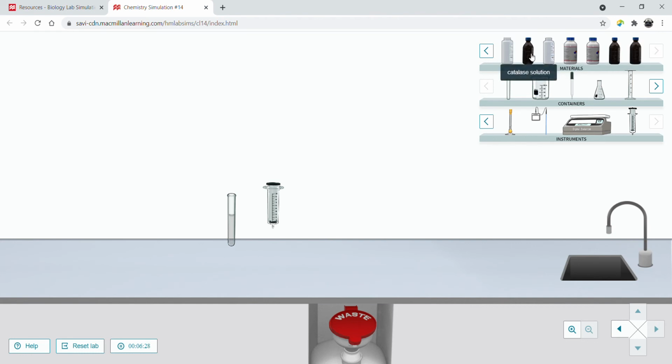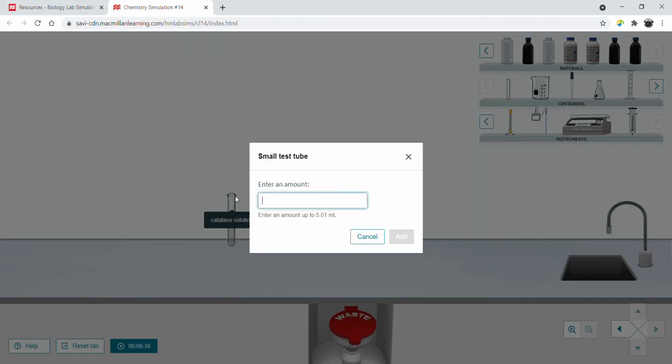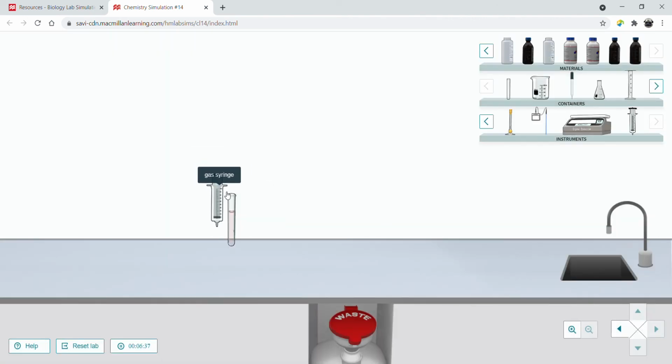produced. Okay, here's our catalase. That's our enzyme. We're going to try to do this really quickly. So we're going to add this. It wants us to add 1 ml. Go ahead. And then we're going to put it on there real fast. Okay. The timer is down here. We're going to wait for 15 seconds, so 6:55. I saw a few bubbles, so something's happening.